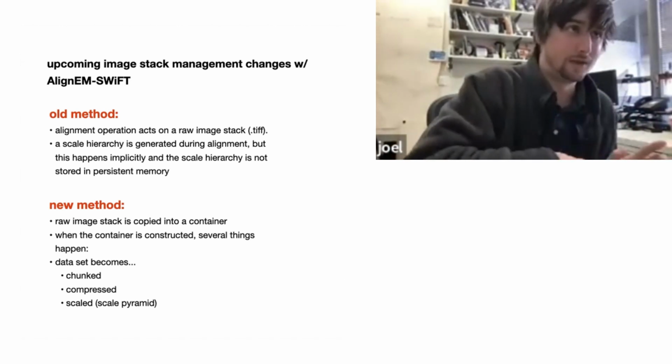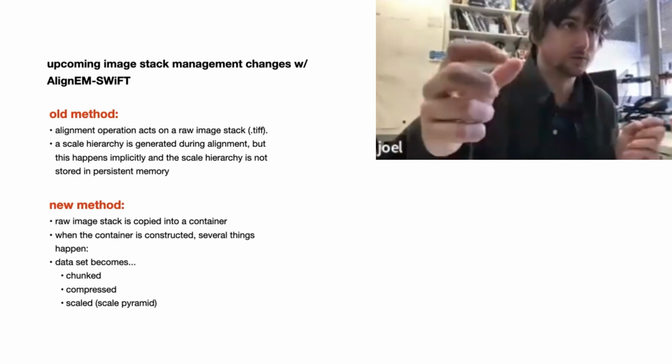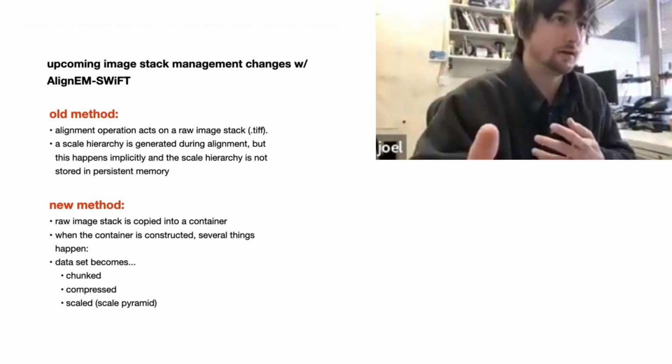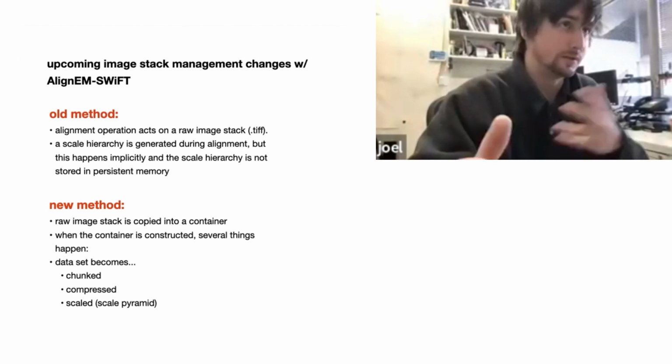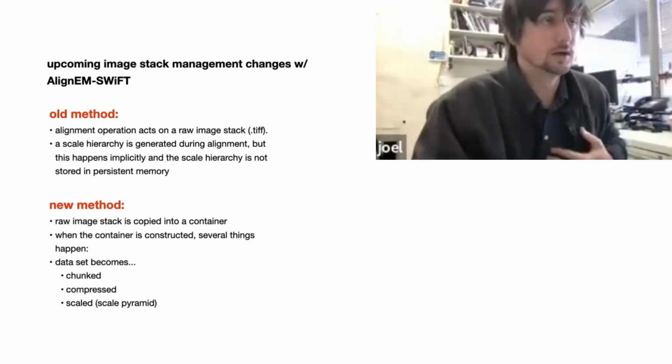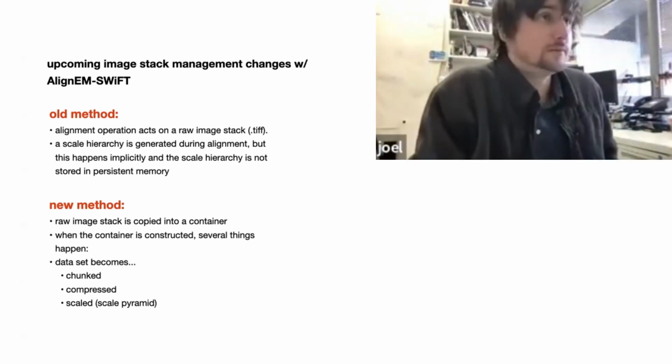And then, since we've started a local server, the NeuroGlancer Python API is going to take care of the rest of the work to create a NeuroGlancer view, like you just saw Shweta demonstrate. Did I answer your question?